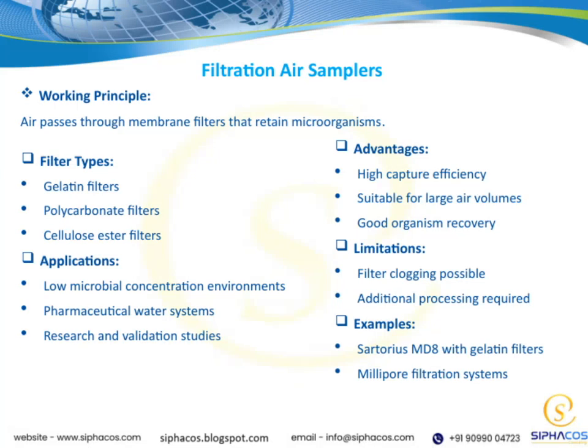Let's take a closer look at the advantages of this filtration method. One of the key benefits is its high capture efficiency, meaning it's very effective at trapping microorganisms from the air. It's also well suited for handling large air volumes, which is important in many industrial and environmental monitoring applications. Additionally, it offers good organism recovery, ensuring that we can accurately quantify the microorganisms collected.